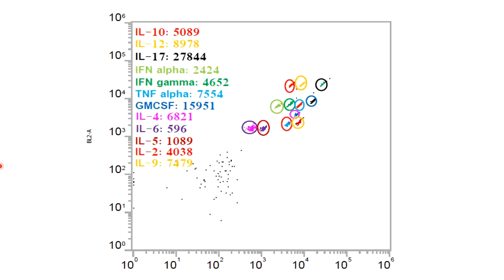Flow cytometry comes with a bead array, the cytokine bead array, in which 13 to 18 cytokines or proteins can be measured in a given liquid without cells, and the instrument can measure sensitivity up to 2 picograms per ml. Amazing. You can see that we are measuring IL-10, 12, 17, TNF alpha, interferon gamma, GM-CSF, IL-4, 6, 5, 2, 9.